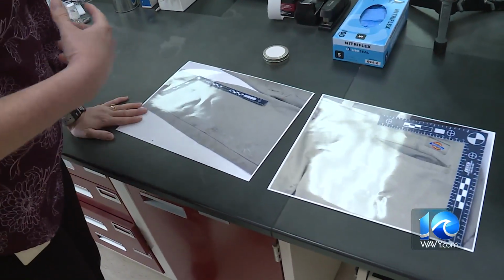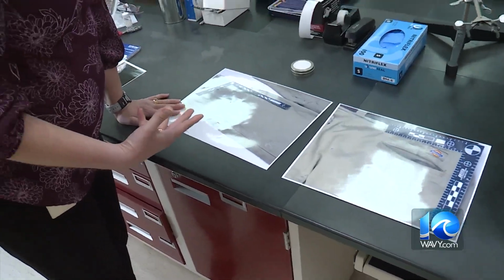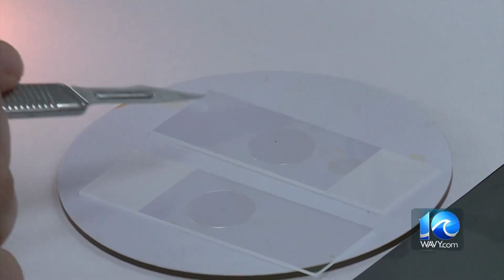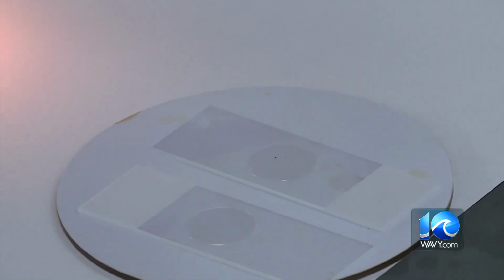Generally, we're going to be collecting between a tablespoon and sometimes as much as half of a cup of dirt and debris and dried blood, body fluids, and then hopefully some paint. Christie then separates the debris into multiple tins and searches for pieces of paint, which is successful about 50% of the time. Moving everything around with tweezers to make sure that we make them flip over to see if there's anything in there that is paint.